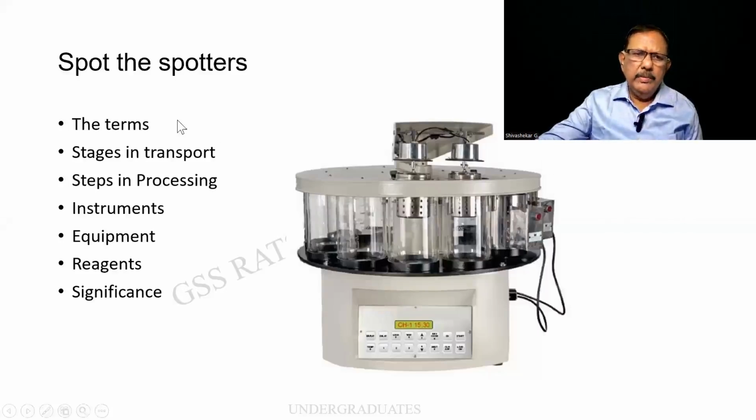So the terms you should know: the stages in transporting, processing, what are the instruments and equipment being used, the reagents and their significance. Incidentally, keep guessing what this equipment is.